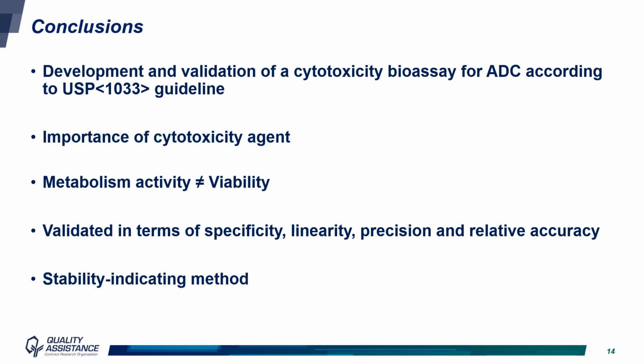The method was finally validated according to the USP 1033 guideline in terms of specificity, linearity, precision, and relative accuracy. Moreover, the method was demonstrated to be stability indicating and therefore allows the detection of degraded samples.